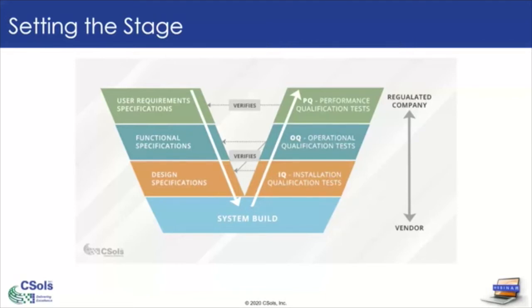So like I mentioned before, the tests for install qualification, IQ, are going to be linked to your design. They're going to verify how the system is designed, modules are installed, and it's set up to run in your environment. Then the OQ ties directly to your functional specs. There may be some involvement of your design specs in your OQ, more specific to functionality, and we'll touch on that later.